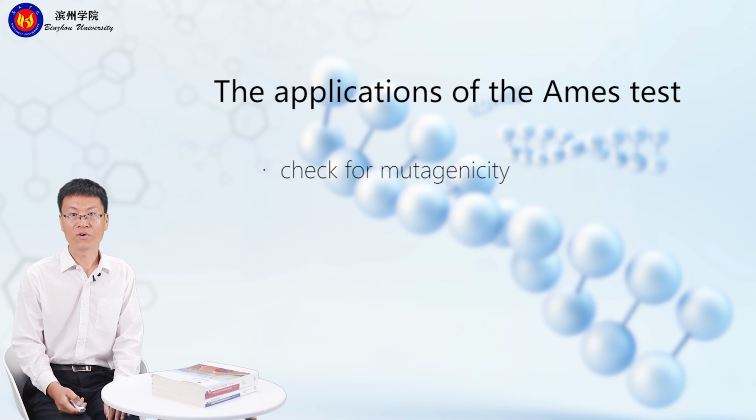However, it is found that mutagens detected in the Ames test are also carcinogens, so it can be used to screen mutagens that cause mutation, which have a carcinogenic effect on humans and animals. It can be used to detect mutants in a large population of highly sensitive bacteria.